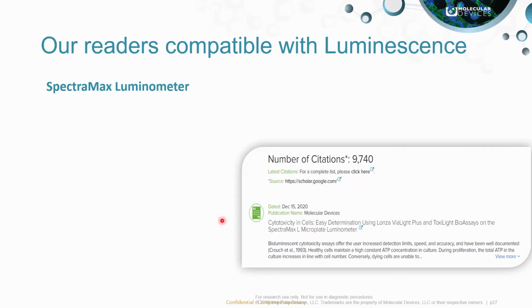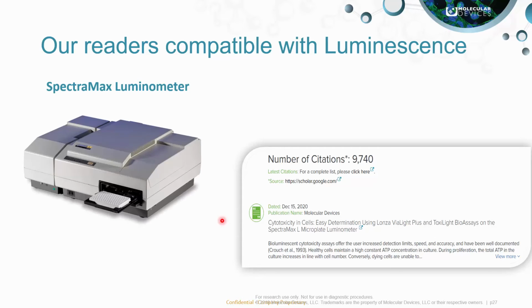So this is just showing the compatible luminescence reader, the SpectraMax from Molecular Devices.